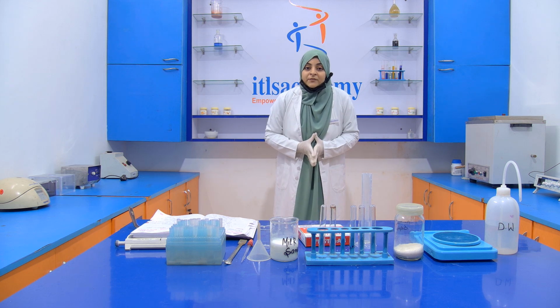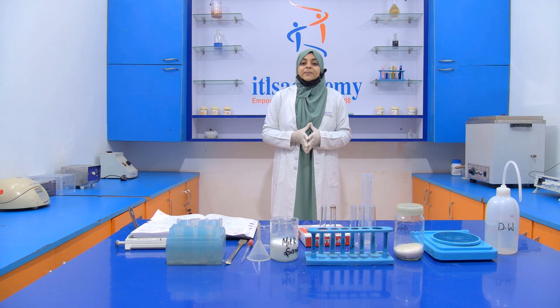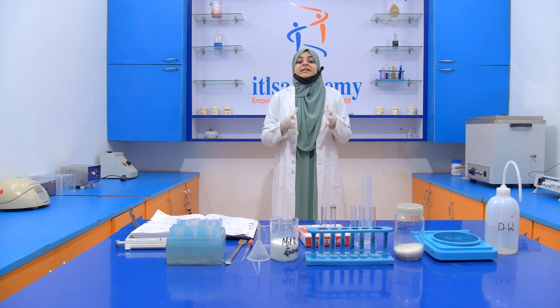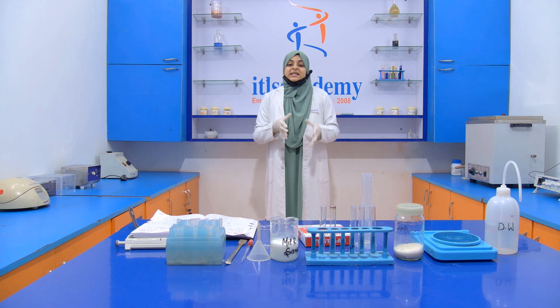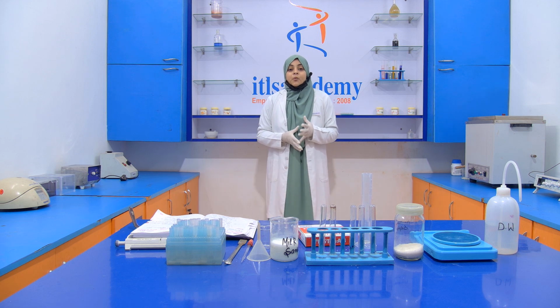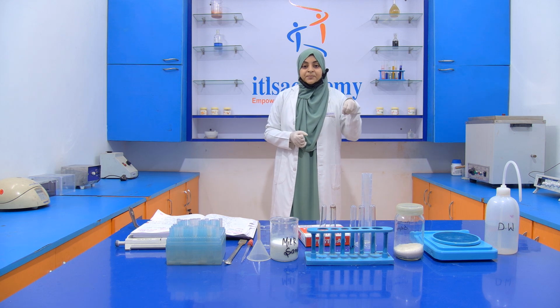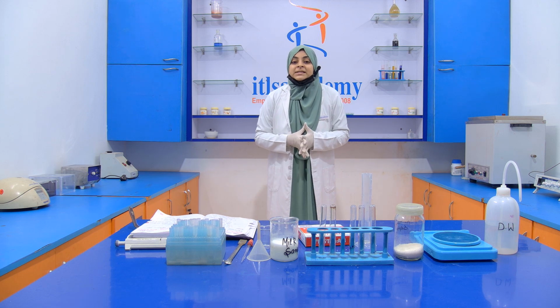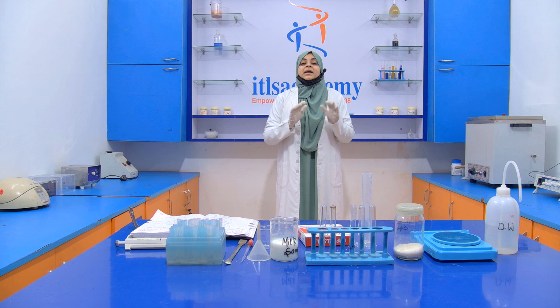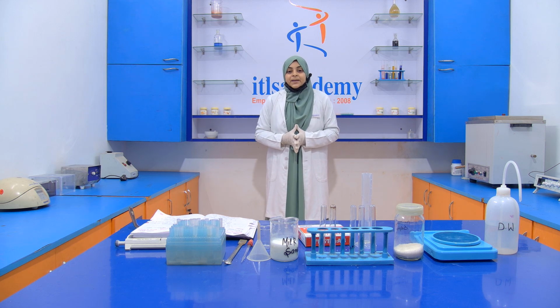But when we get milk from the industry, that type of milk is sterilized milk. It kills all types of microorganisms during this process. So we have to check the turbidity. If turbidity is present, it will indicate that our sample is not properly sterilized. This experiment is very simple.